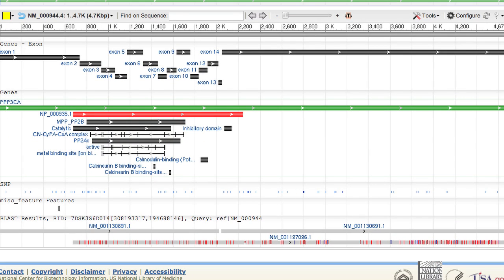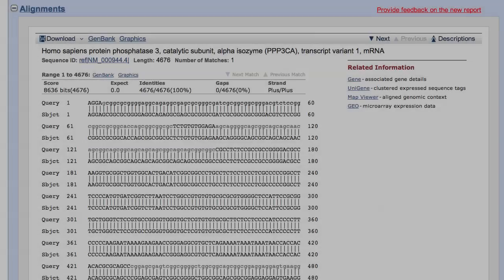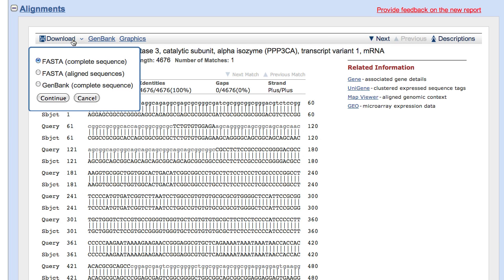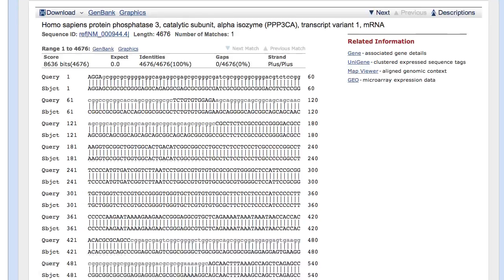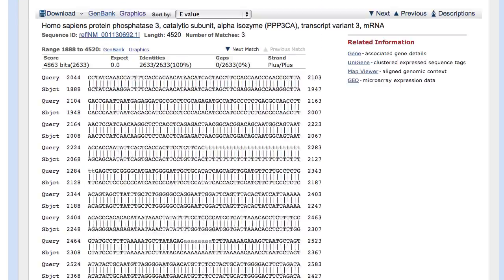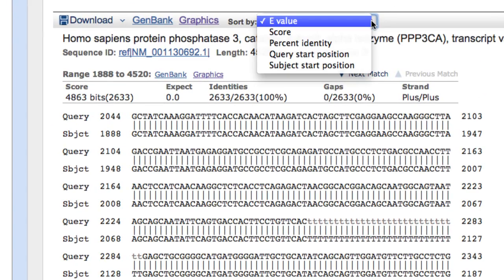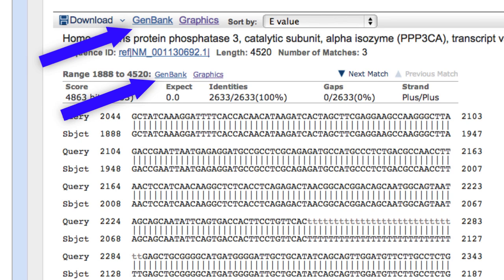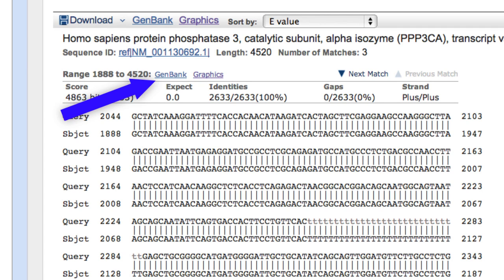Be aware that the graphics links from the alignment section show features of the hit sequence, not the query. In the alignments section, the download menu only acts on one alignment at a time. In cases where more than one alignment is made to the subject sequence, you can sort the alignments. The graphics or GenBank links let you optimize the initial view for either the whole subject sequence or for the specific alignment.